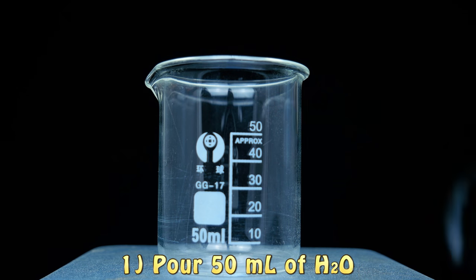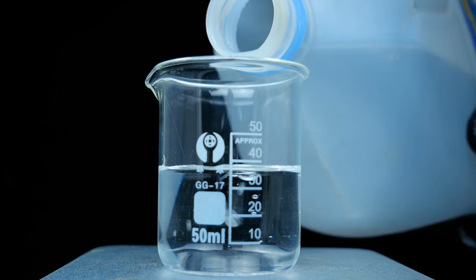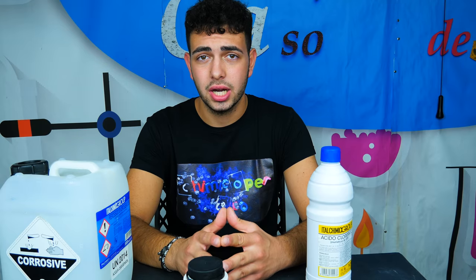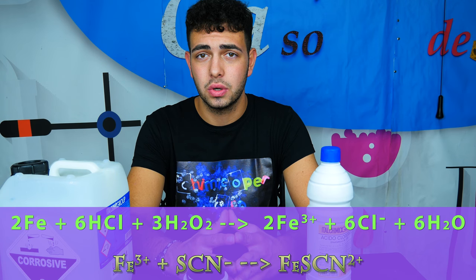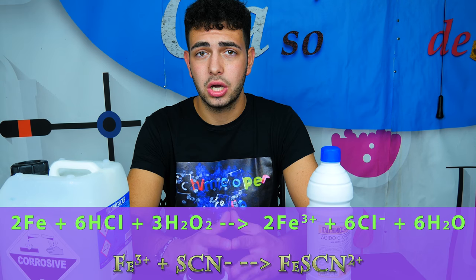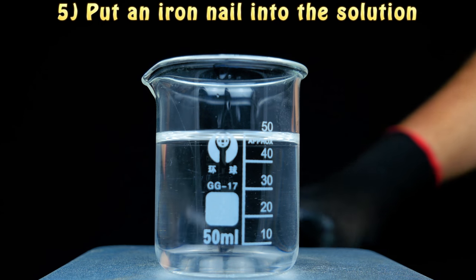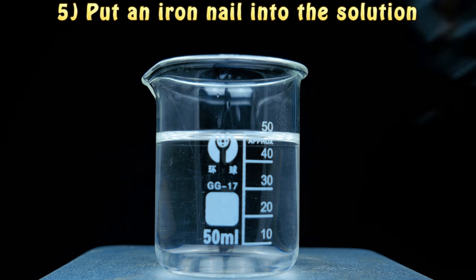Once we've prepared our solution we just drop in the nail, and we wait for 30 to 40 seconds for the reaction to happen. What happens is that hydrochloric acid and hydrogen peroxide together oxidize our nail into iron(III). This iron(III) reacts with thiocyanate to form a complex that is really similar to blood, and it forms only on the surface of the nail.